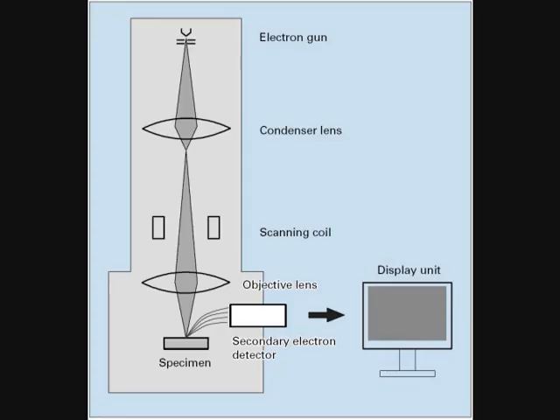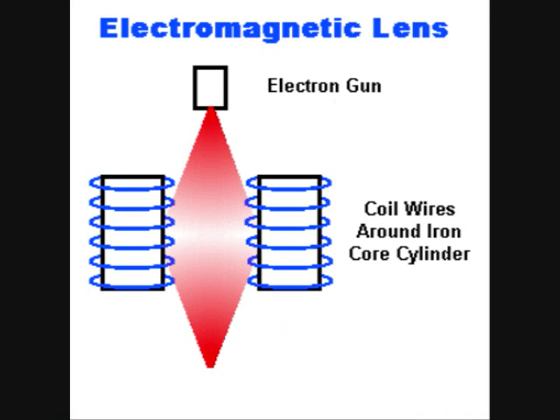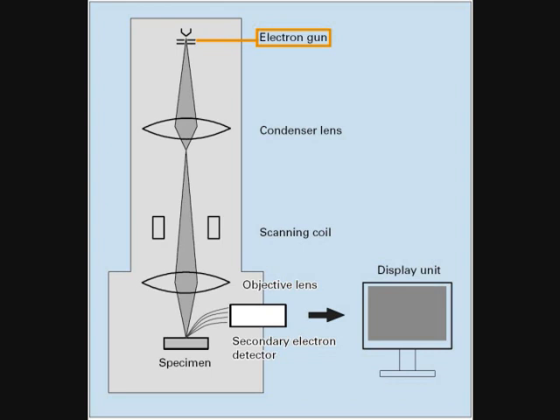The mechanism of focusing in a scanning electron microscope is magnetic confinement of the electron beam. The column of the SEM has sets of electromagnets, which form electromagnetic lenses, which are used to focus the electron beam in a similar manner to optical microscopy. As the electron leaves the electron gun, its direction is roughly down the column. The magnetic fields collect and collimate the electrons to form a coherent beam.